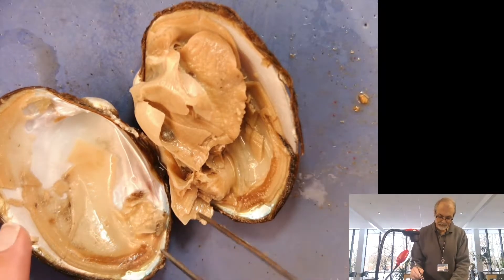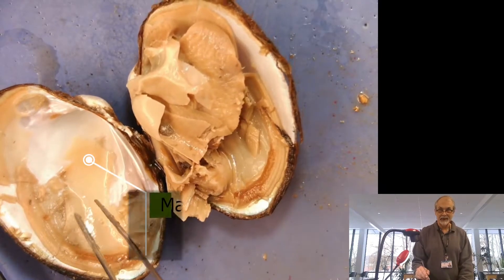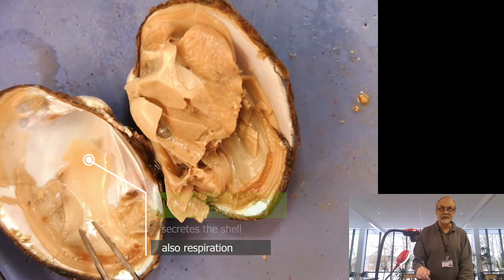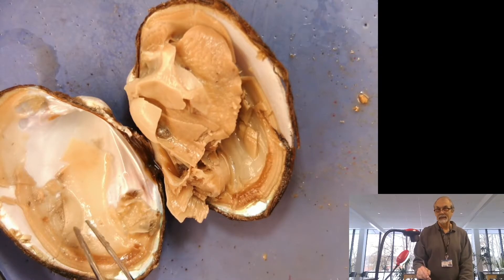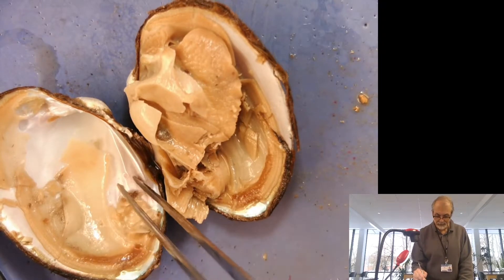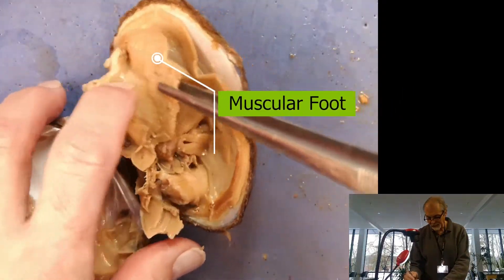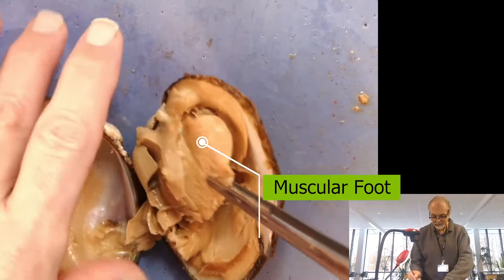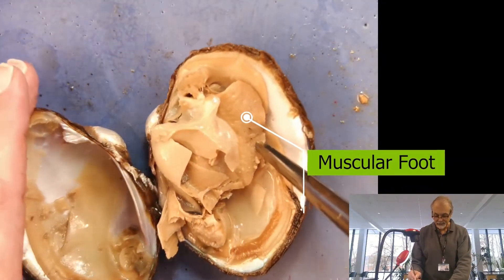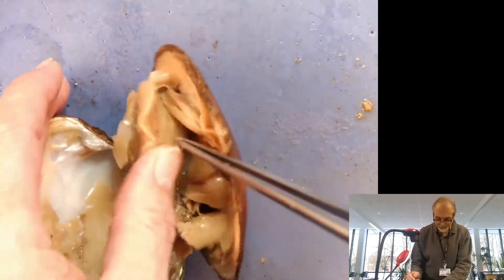You can see the shell here. This material here is part of the mantle, and the mantle actually secretes the shell. The mantle also, in mollusks, can serve as a structure involved with respiration — it has different functions. But this secretes the shell. Now, if you look here, this really tough material on the bottom — that's the muscular foot. It's very, very hard. That would be how it burrows into the substrate — that's how it burrows and moves.